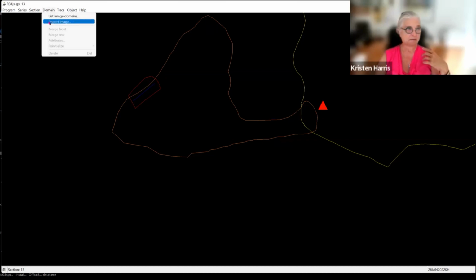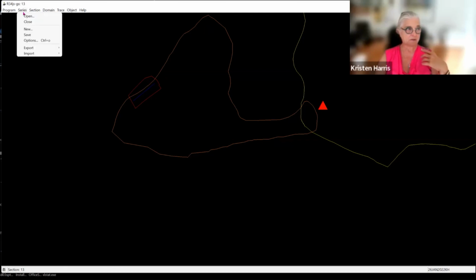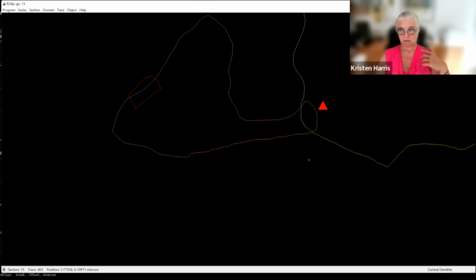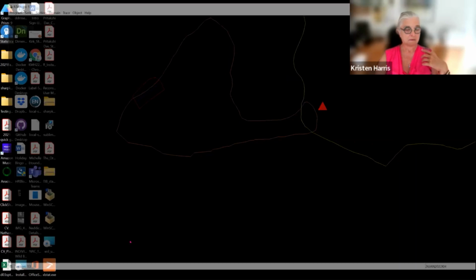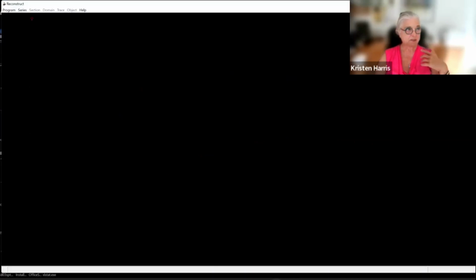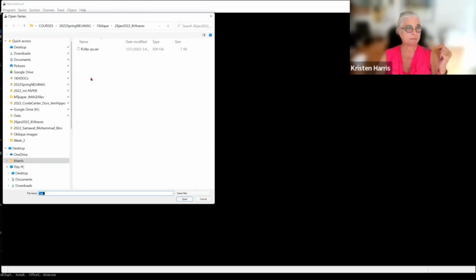Let's start over again. I'm going to change this to options. Not going to hide the domains, I'm going to unhide domains. Okay, and then I'm going to exit for a minute and go back out again. That was kind of a special case, so I just wanted to show you what it normally would do.